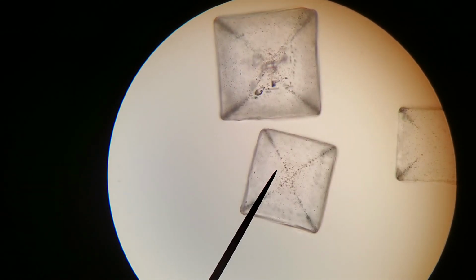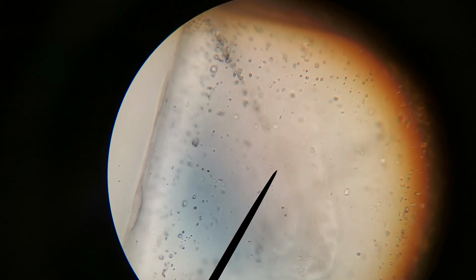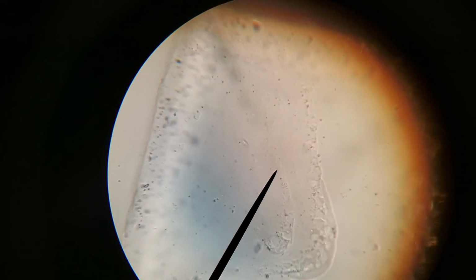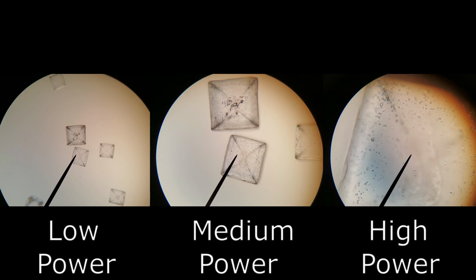Once we've found our focus, then if we want to, or if we need to, we can switch to the high magnification lens, but that's not always needed, and actually sometimes it's not the best idea. As you can see here, when we switch to our high-powered magnification, we lost a lot of the detail in the sample that we actually may have found interesting. So it's important for you to stop at the magnification that gives you the greatest detail without losing any context in your image.